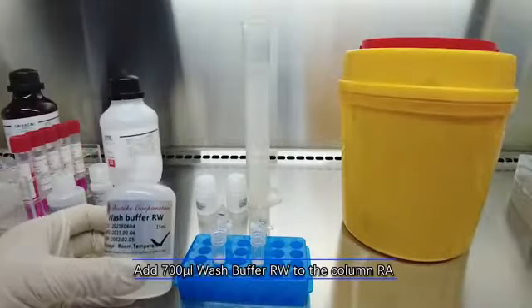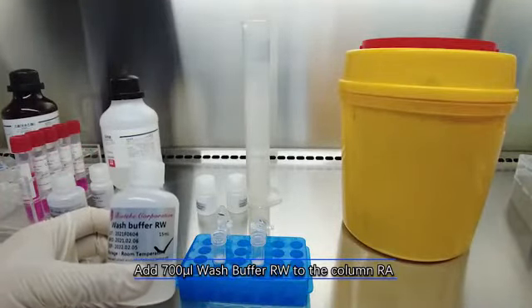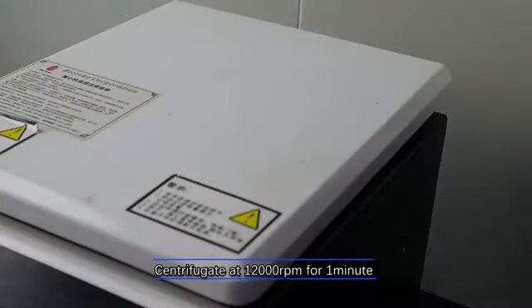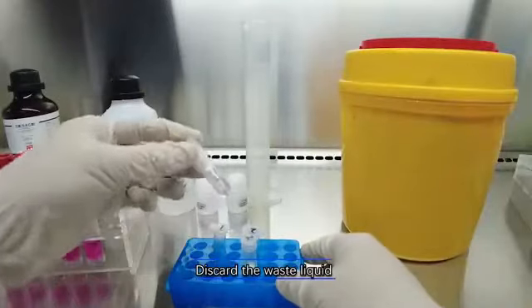Add 700 µL wash buffer AW to the column I. Centrifugate at 12,000 revolutions per minute for two minutes. Discard the waste liquid.